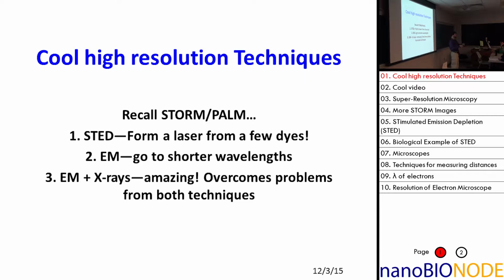This is a fluorescence technique, and it's the diffraction limit of light, which is about what? Lambda over 2, and lambda is the emission wavelength. So lambda is 500 nanometers. That's bluish green. So it's about 250 nanometers.